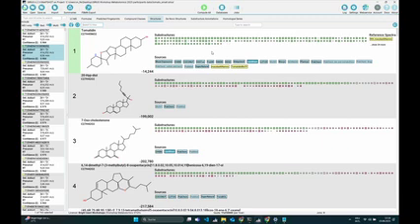So if I now upload a new version, a number of SMILES, would that improve the annotation in CANOPUS, or would that not be affected? No, it would not be affected. The whole idea of CANOPUS is to not take into account any structures, but to annotate de novo just from the fingerprint.